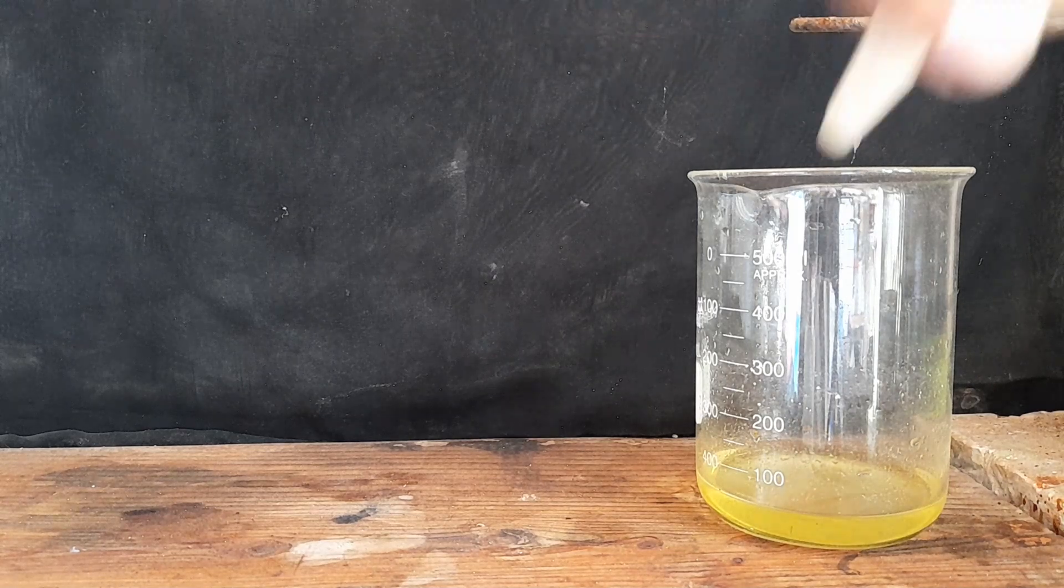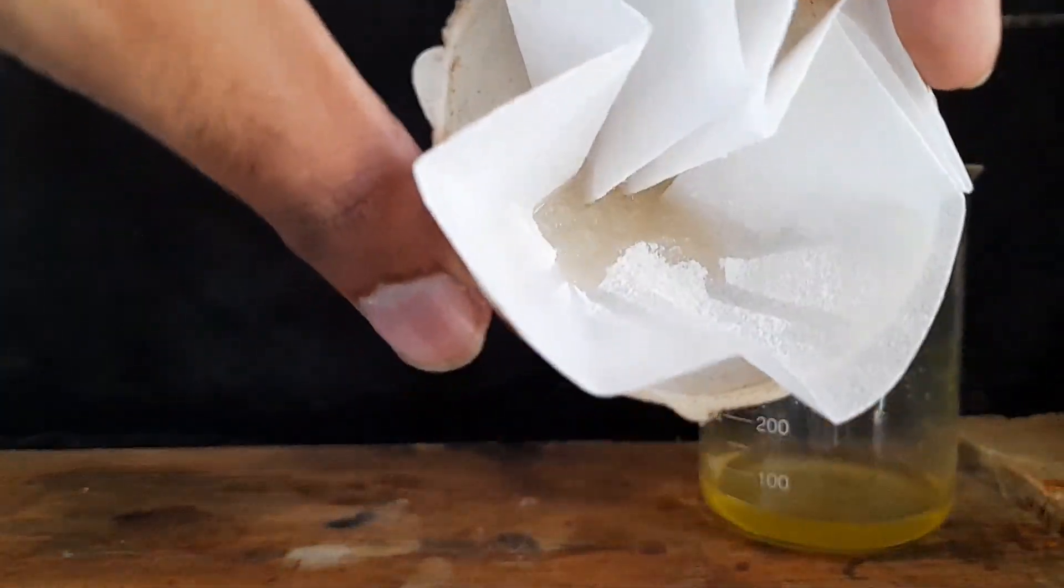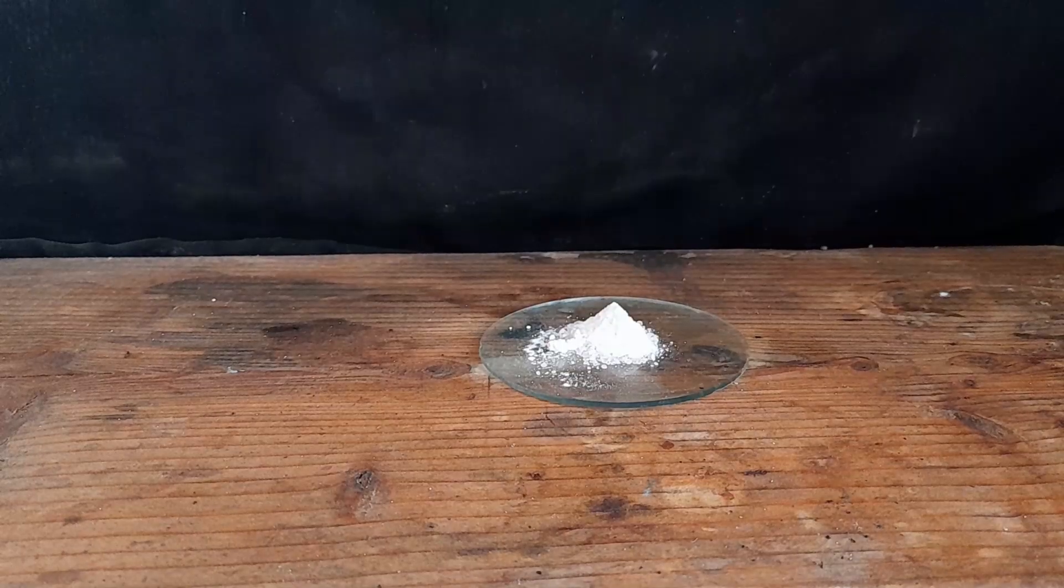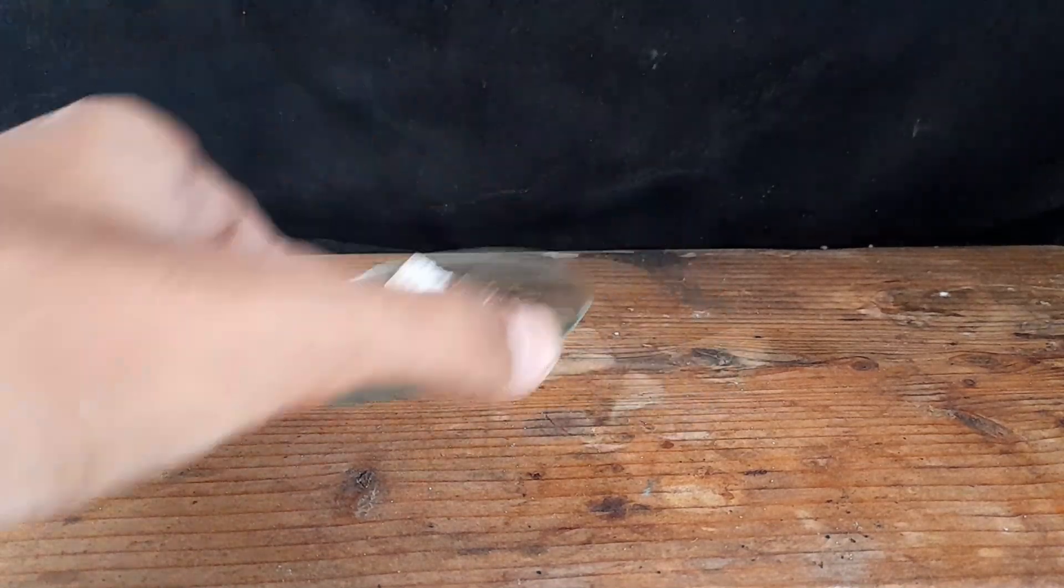Now remove aluminum oxide from filter paper and dry it. After drying this is the final yield.